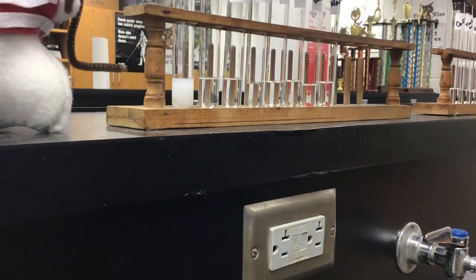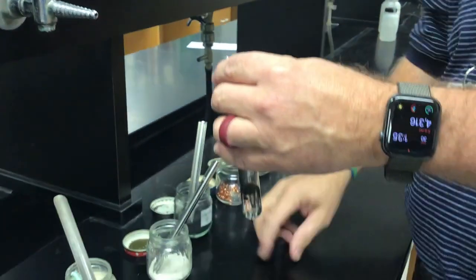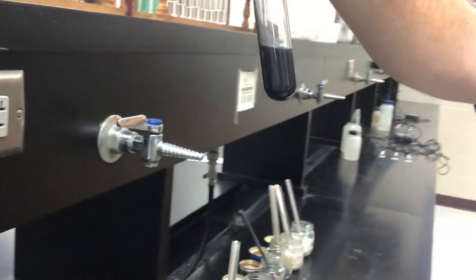So the next one was graphite. So we'll put the graphite in there, just a little bit of graphite. Put an awful lot in there last time, but that's all right. Graphite in there. We'll shake that up. Just take a look at that. We'll let it settle for a bit and then come back and look at it at the end.